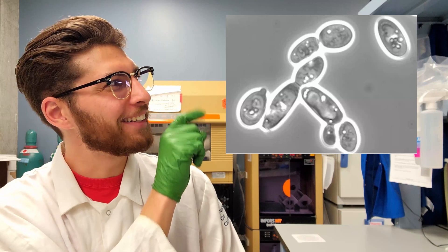I think it's cute to call Yarrowia lipolytica by its adorable nickname, YALI. For over two years, I've worked with YALI for my PhD. My lab is full of YALI experts. We invent CRISPR tools to work with this oleaginous yeast. So today, I'll share everything I know about transformations of Yarrowia lipolytica. Welcome to DIY Biotech.